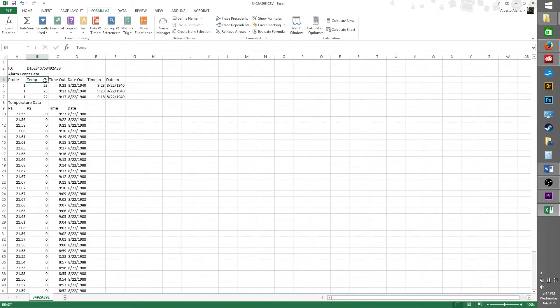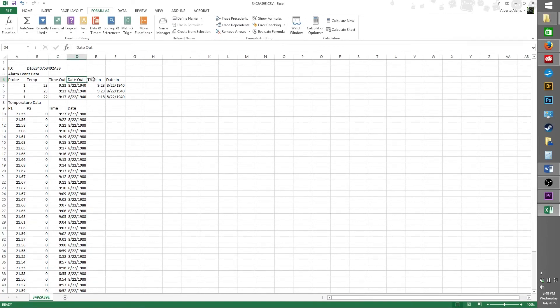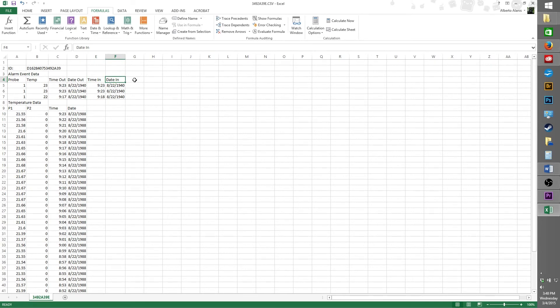Temperature indicates the alarm set point that was triggered. Time out indicates what time the environment's temperature went out of the alarm range. Date out means what day the alarm occurred. Time in indicates what time the alarm returned from being out. And date in indicates on what day the time in occurred.